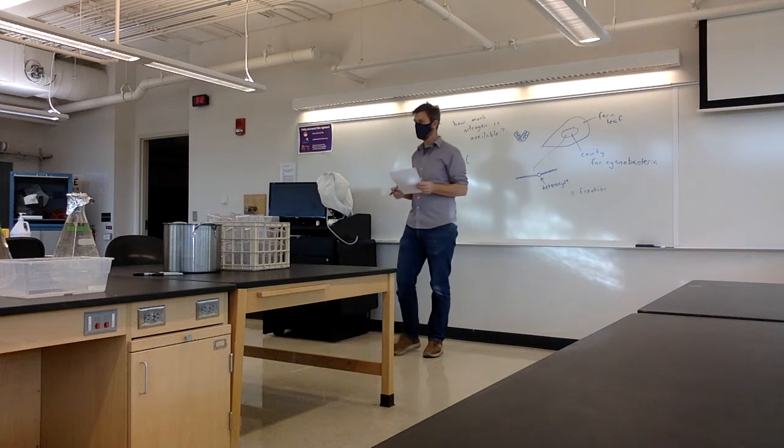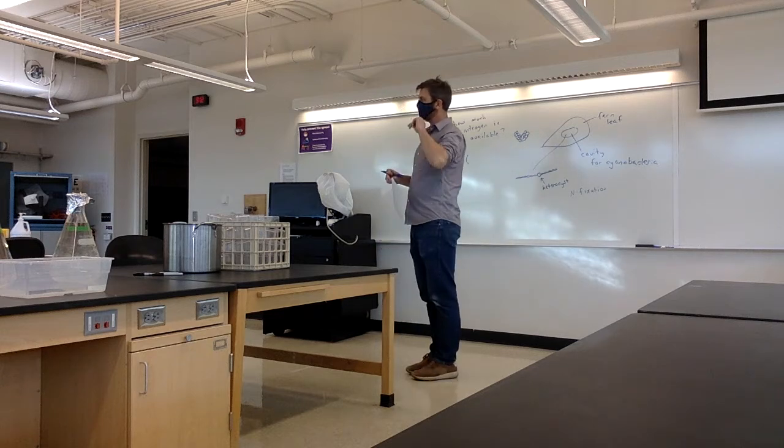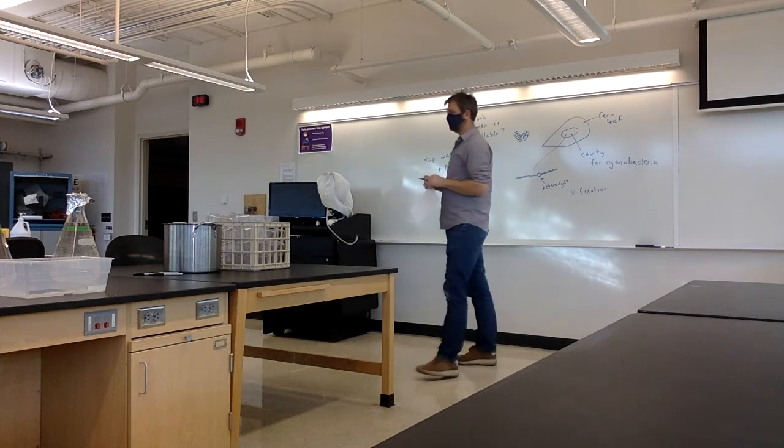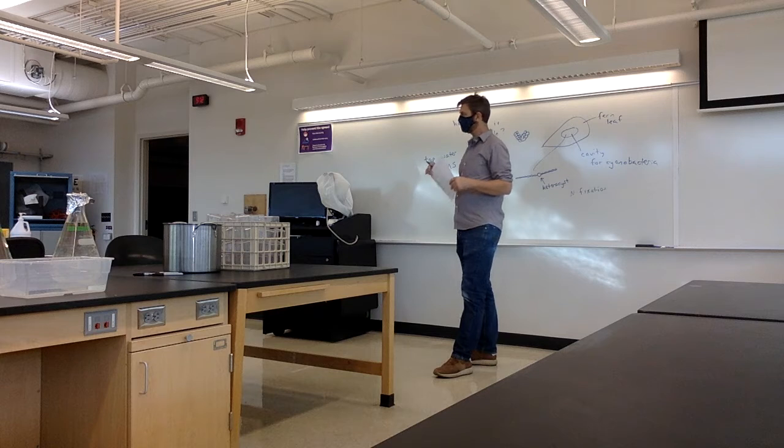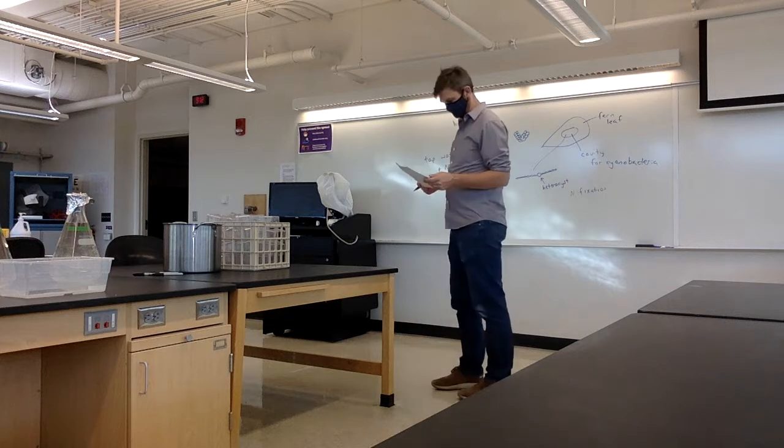So it has their nitrogen needs, their phosphorus needs, their potassium needs, and then even some trace elements, magnesium, calcium, all the way down to, I don't even know what the finer, manganese is a little bit in there, I think.